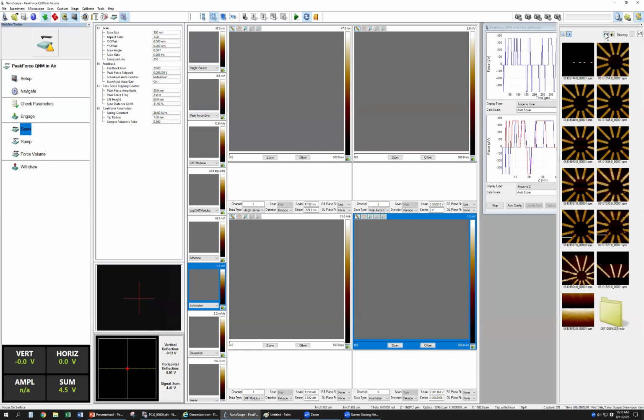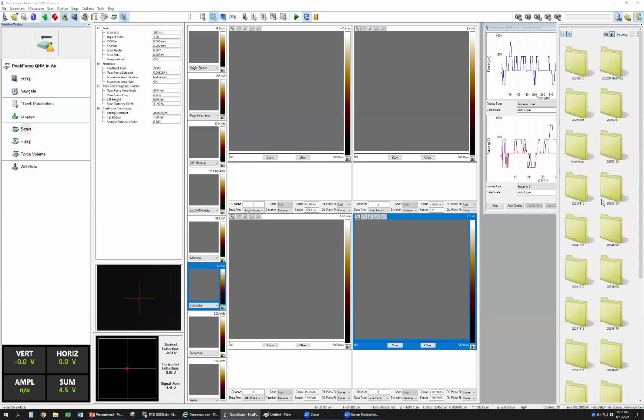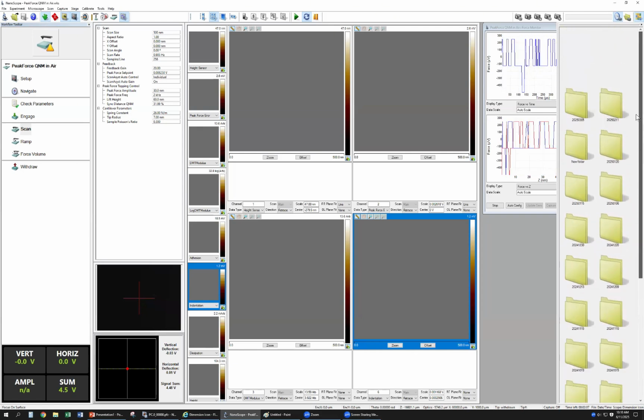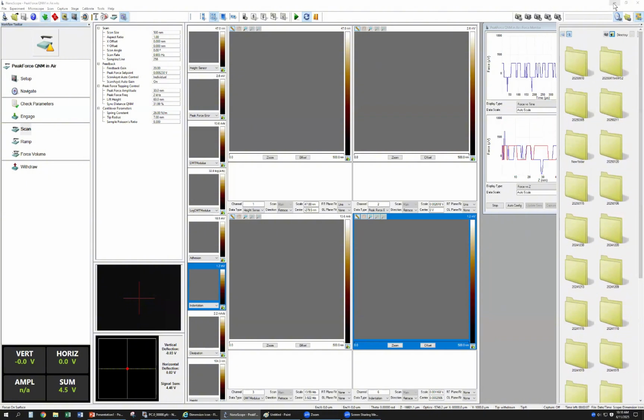Yesterday we found the first curve, right? Strange. Can you go to the first curve? I try. You try that.